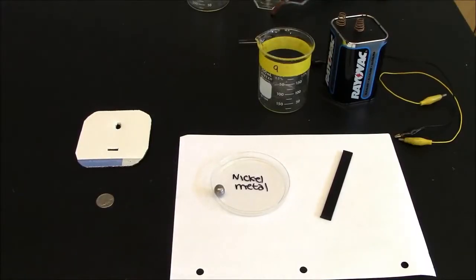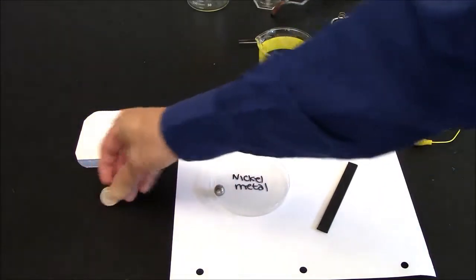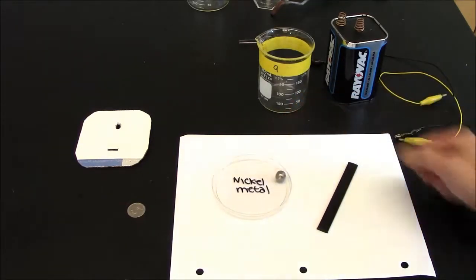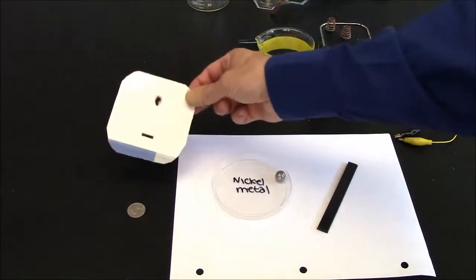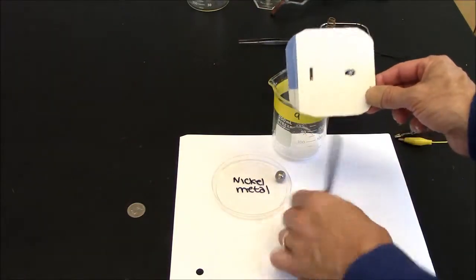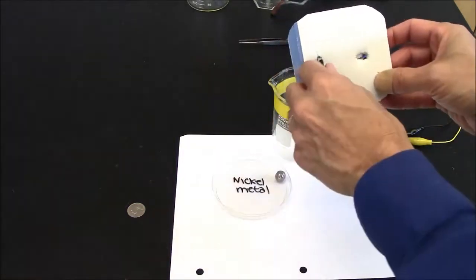The equipment needed for this lab: you'll have a carbon fiber electrode, a nickel coin, a 5-cent coin, a sample of nickel metal for comparison, and a 6-volt battery. This is a cardboard lid designed for a 250 ml beaker, and notice it has one slot that'll be for the carbon fiber electrode, and the other slot will be for the coin.